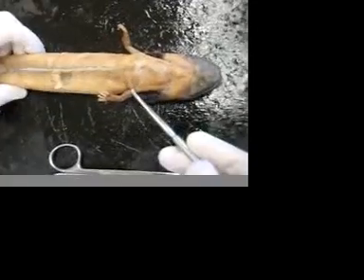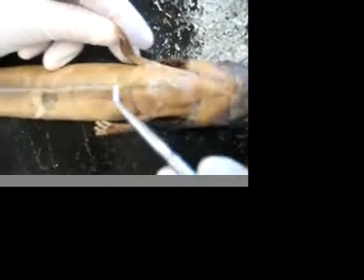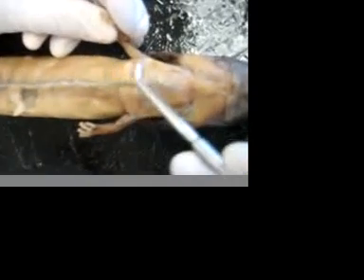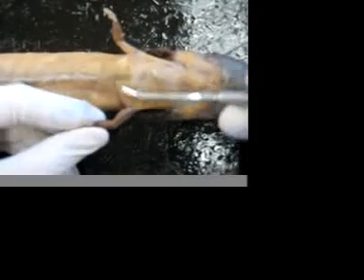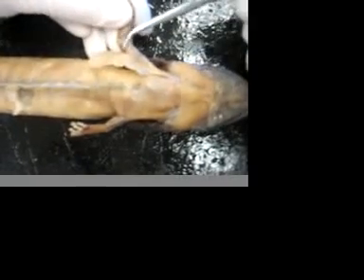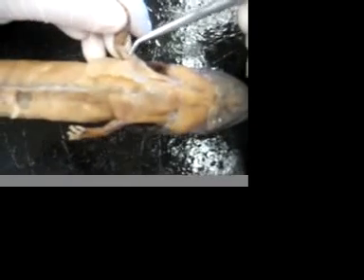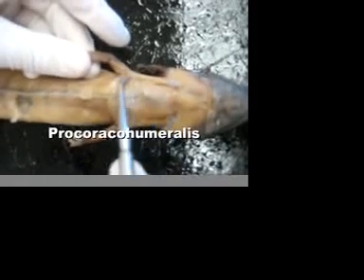Here we're looking at the ventral side of a Necturus. Starting right here, this is the pectoralis that we've kind of severed off. Directly anterior to that is the supracoracordius right there. On the arm, this little muscle right here is the coracoabrachialis. And the muscle right here is the procoracohumeralis.